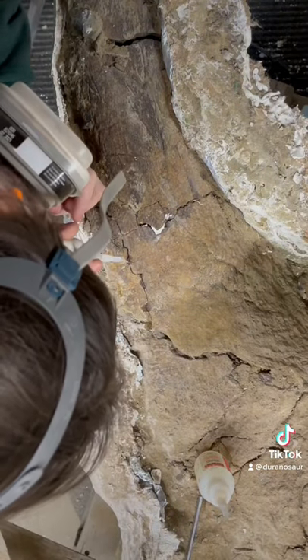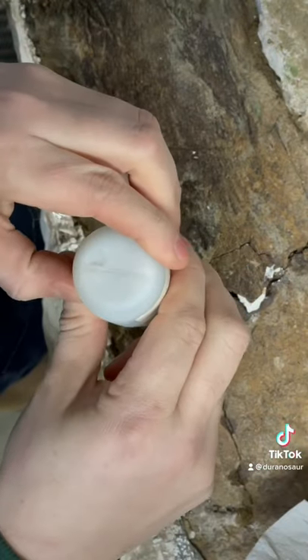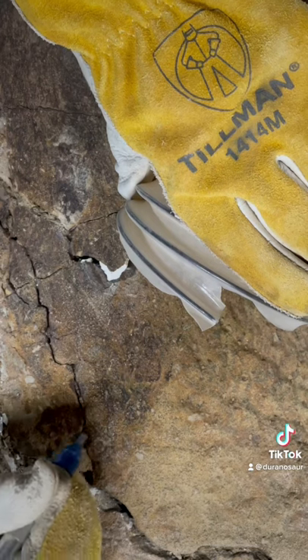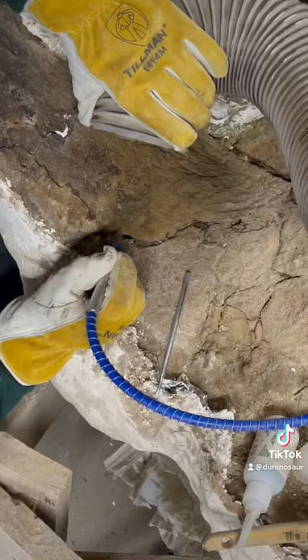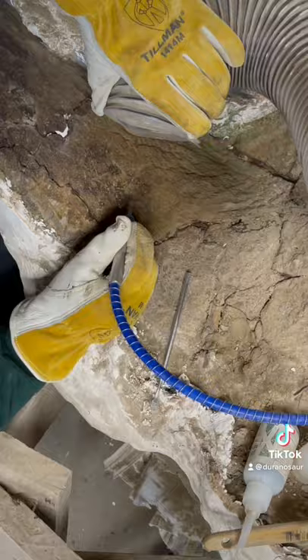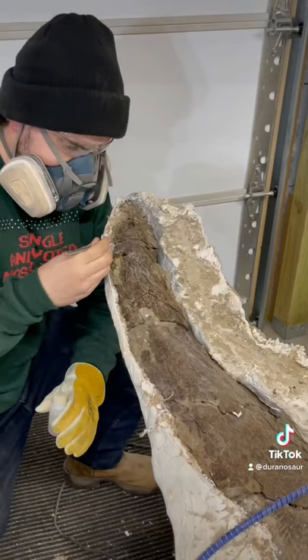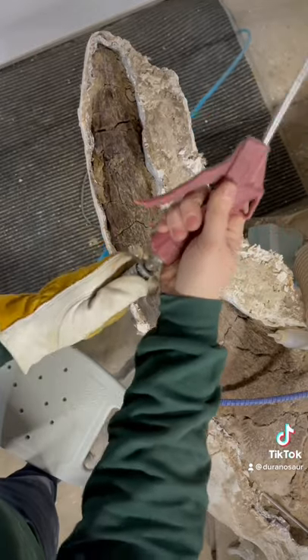For the smaller cracks, I'll use Paleobond Surface Intensive Adhesive. In my left hand is the hose connected to the vacuum dust collector. Once I blast off the sediment of a certain area, I'm able to apply the adhesives into the crack of the bone and hold everything together.